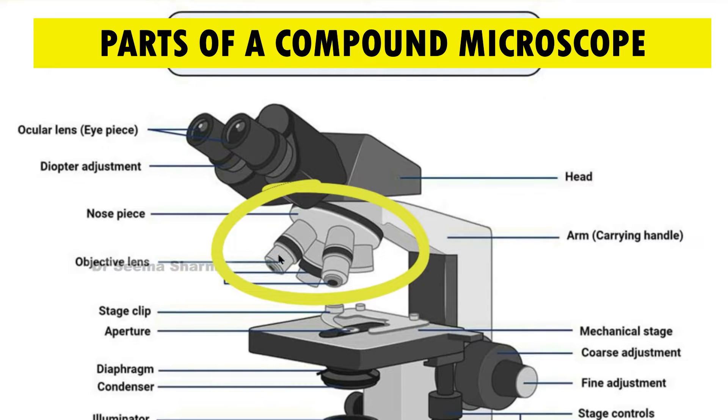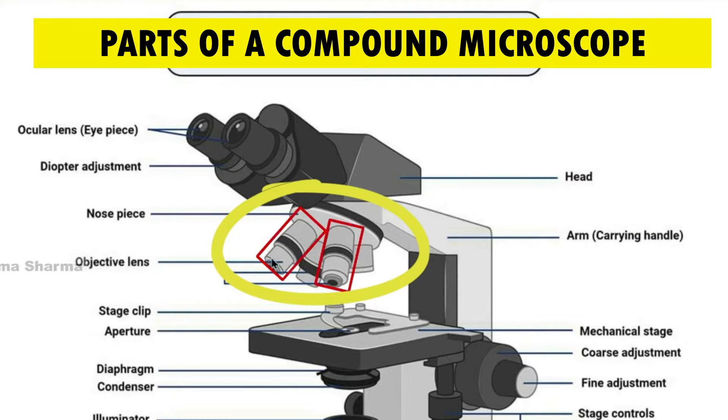Beneath the eyepiece, there is a nose piece, and they both are connected with each other with the help of head. This nose piece is also very important. Pay attention to these tubular structures — they are called objective lenses.